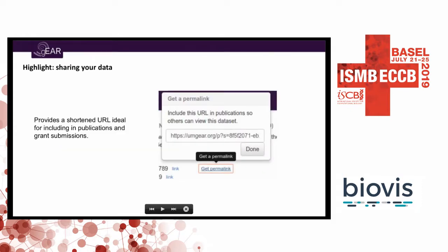You can also get permalinks so that you can link directly and use GEAR as your viewer for expression data in your publication. If people follow the permalink, they go directly to your dataset and can explore it.